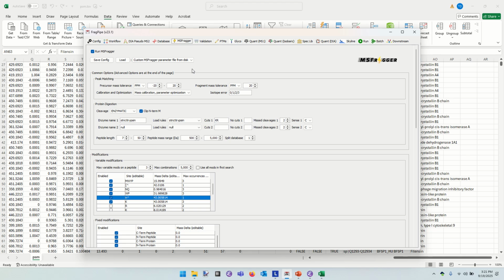Yes, you're still limited in the number of sequences you actually have to work with and number of spectra that you have. Especially if you're dealing with a subset database that contains only a few hundred sequences. It will run, and it will probably give you a reasonably sensible response as well.